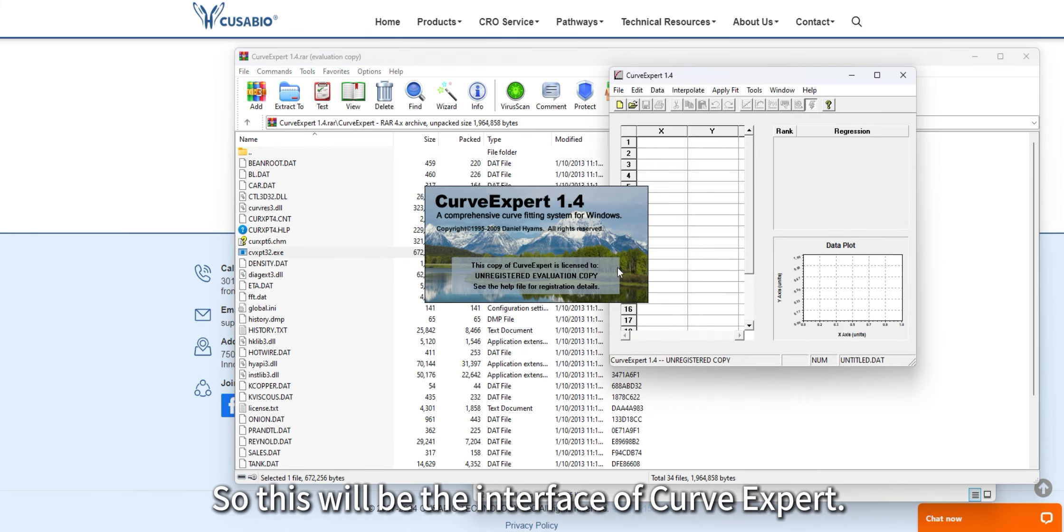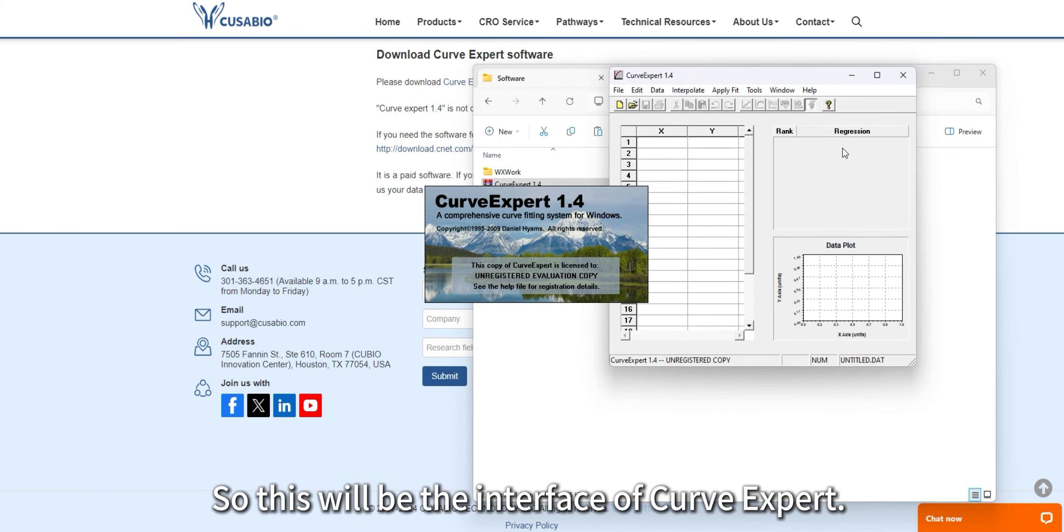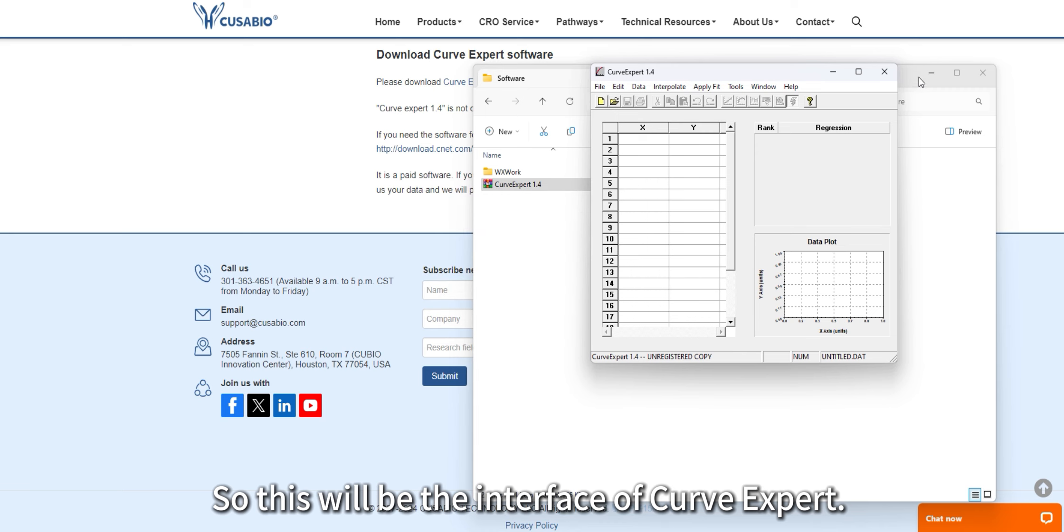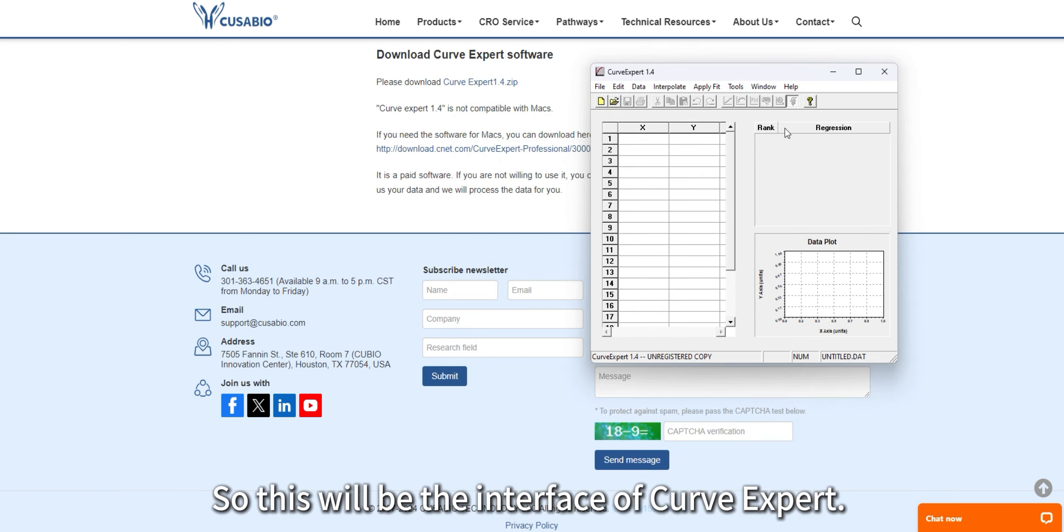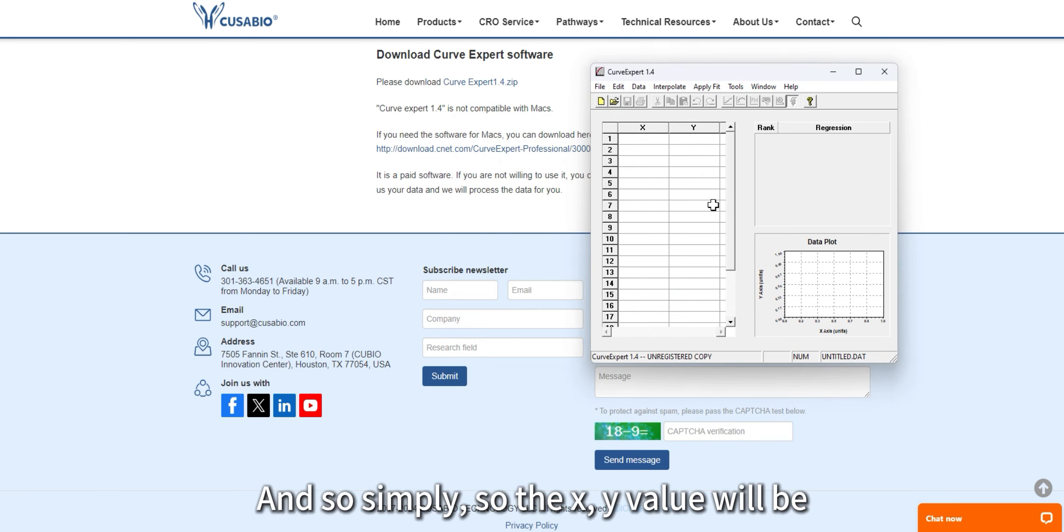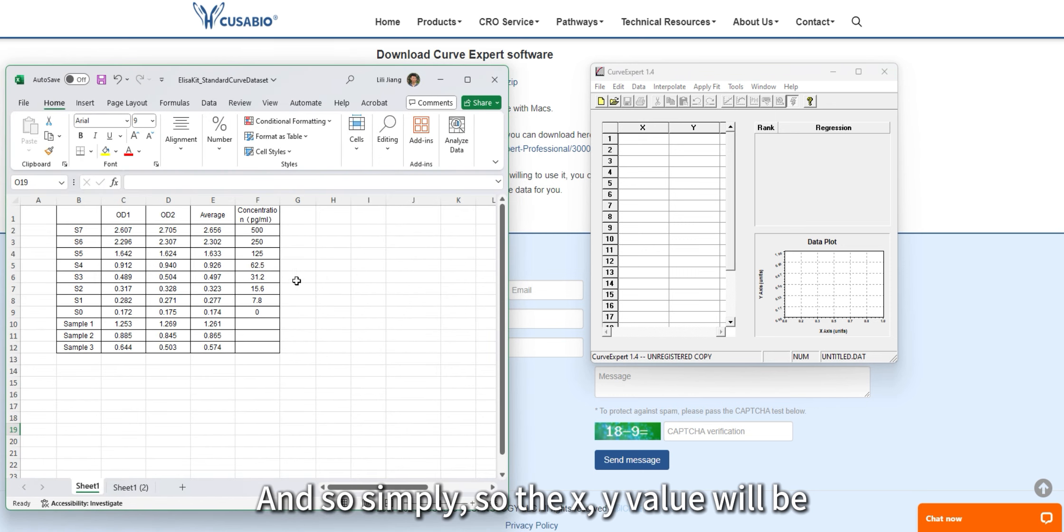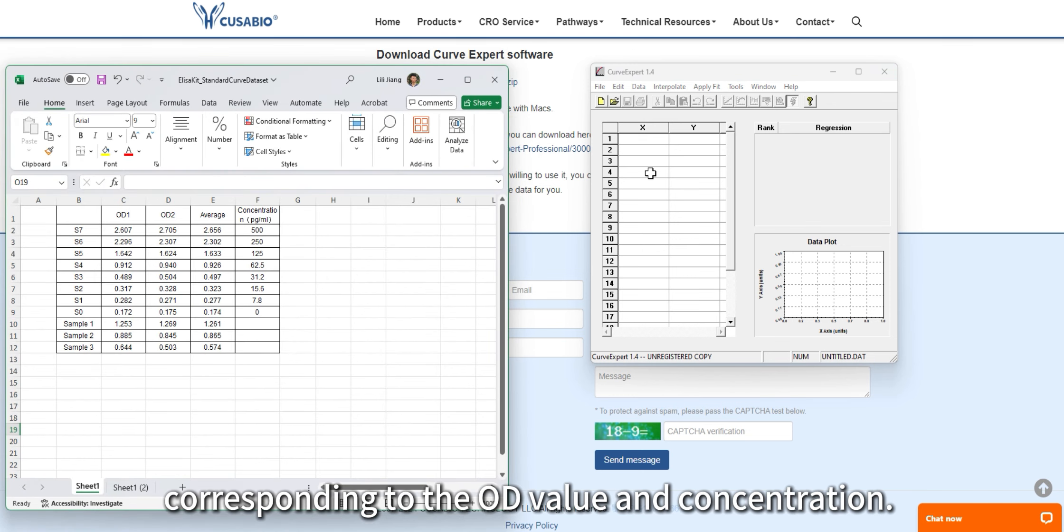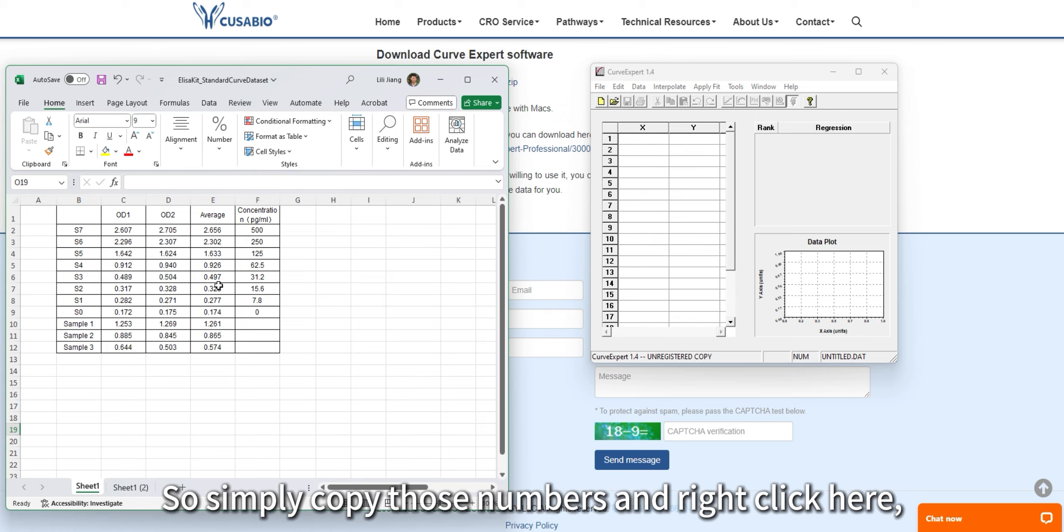This is the interface of Curve Expert. The X and Y values correspond to the OD value and concentration. Simply copy those numbers, right-click here, and paste.